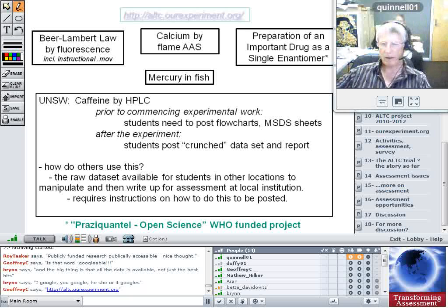Some of the experiments require the students to prepare a flowchart to show the work process, and again that's standard practice: how we're going to go about doing an experiment, what bits need to be done when, and so on. So again, that is something that is commented on through the blog. The students upload their flowchart, and members of staff can go on and comment on it. They might point out that students have missed a step or could improve their efficiency by changing things slightly.